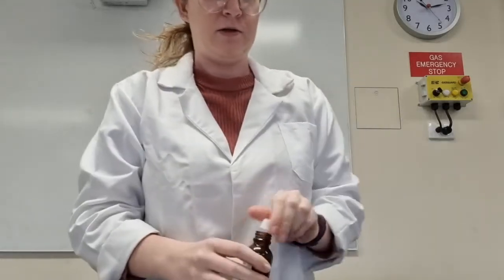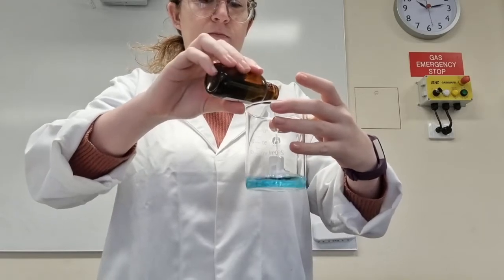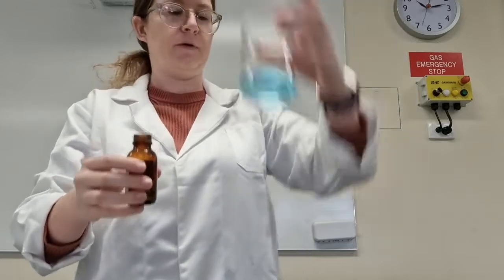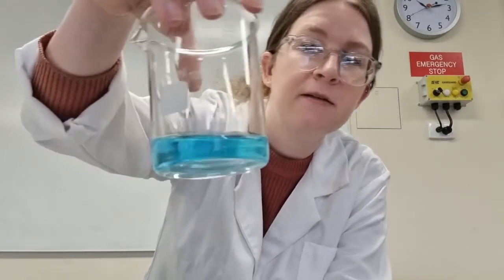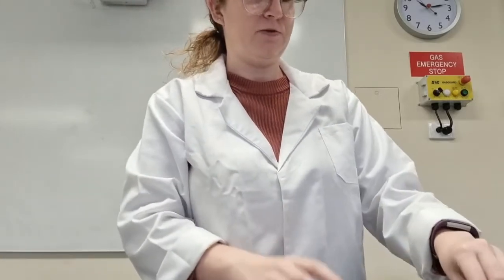All right, so I'm going to pour 50 mils into our beaker. As you can see, there's about 50 mils in there, and I've labelled that blue. Next one, I'm going to add 50 mils of sodium hydroxide.